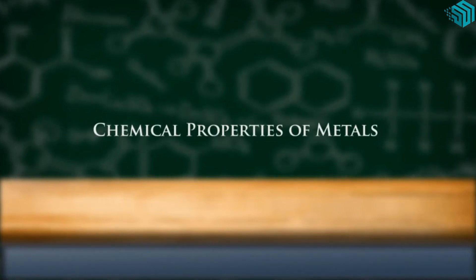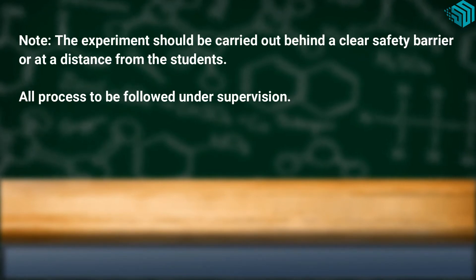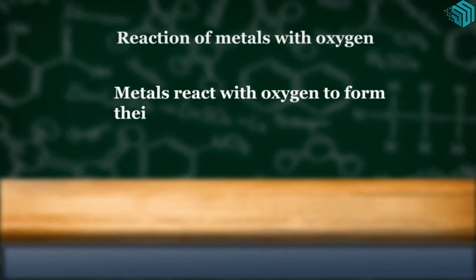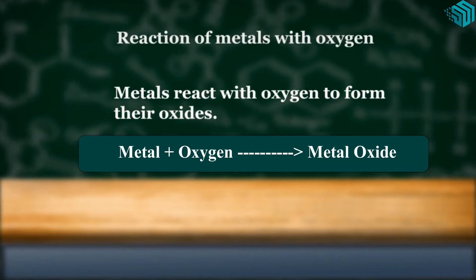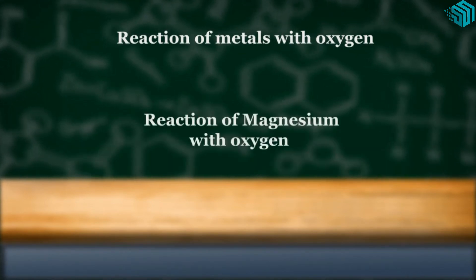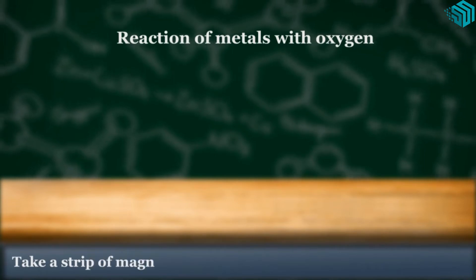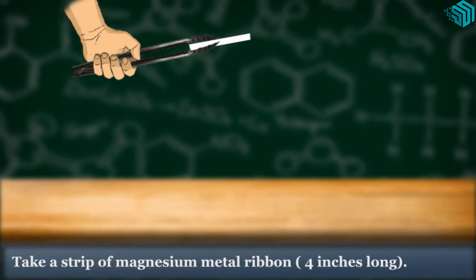Chemical properties of metals. Reaction of metals with oxygen. Metals react with oxygen to form their oxides. Metal plus oxygen gives metal oxide. For example, reaction of magnesium, which is a metal, with oxygen. Take a strip of magnesium metal ribbon, which would be 4 inches long, and a lighted burner.